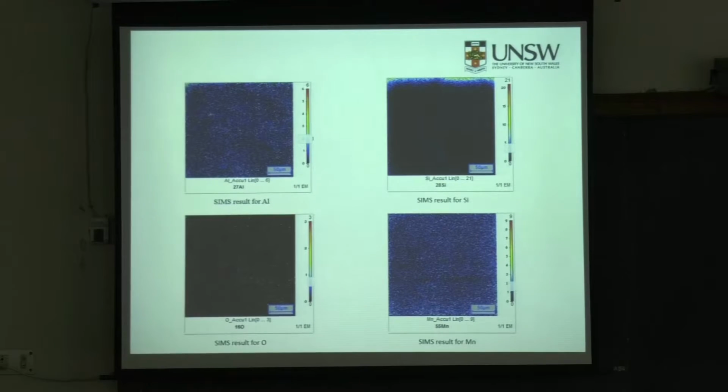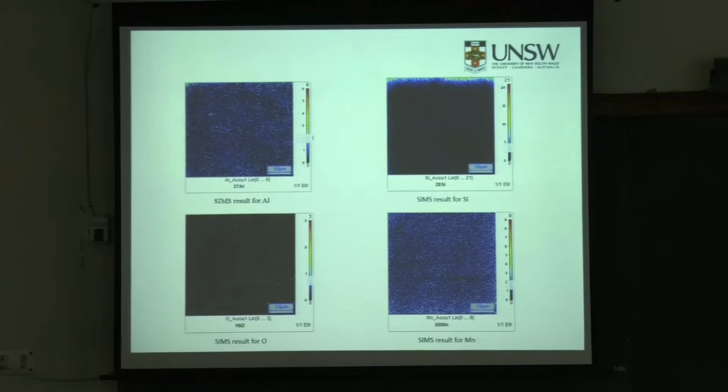So that's why I was saying, do any of you have SIMS equipment in your laboratory? It may be worthwhile going for that. SIMS, okay? That can give you really new information. And when you see that, all these affect the properties, because they actually interact with the epoxy. But this kind of thing you do not see in the EDS. All right? So SIMS can give much more valuable information.